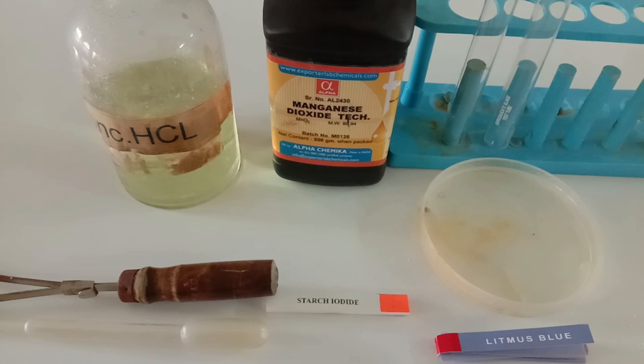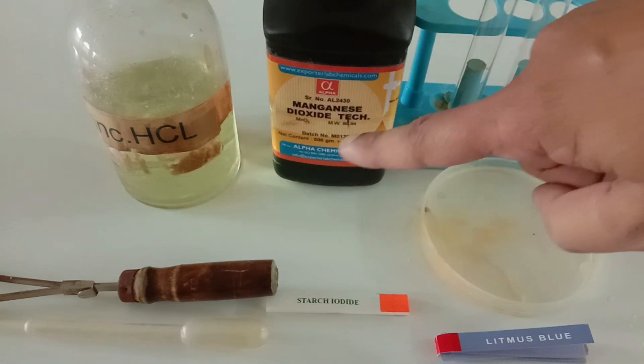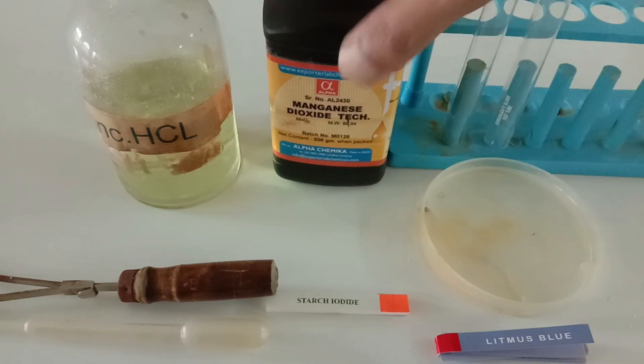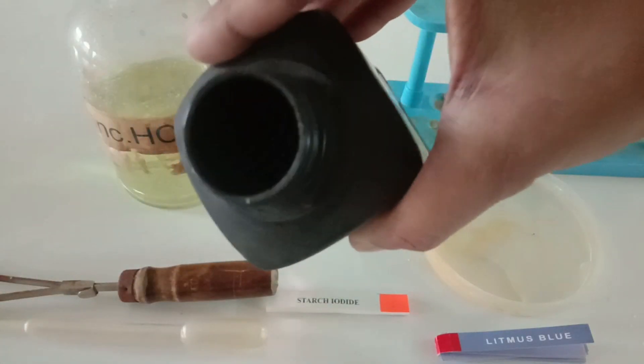For this experiment, I'm going to use concentrated hydrochloric acid and manganese dioxide powder. Manganese dioxide powder is charcoal black in color.